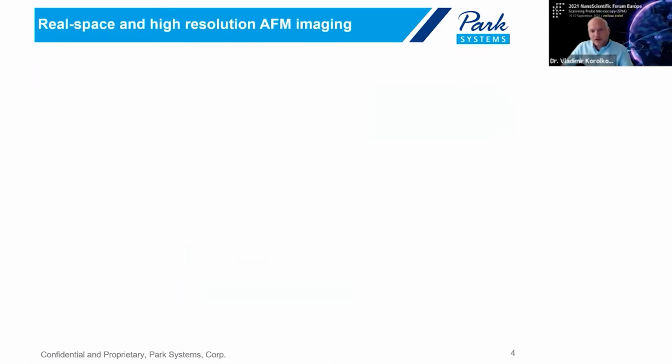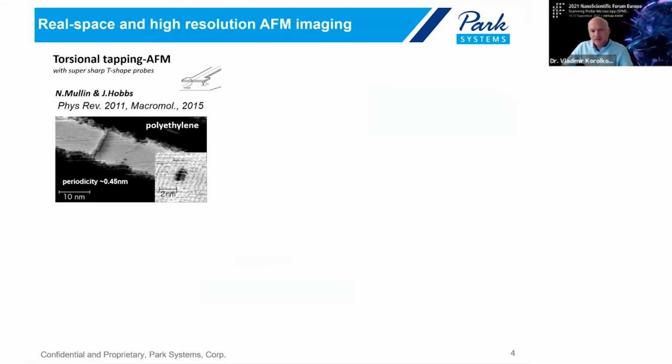So here I made a quick overview of some techniques that provide more or less routine high resolution imaging on ambient AFMs. And perhaps the first one, and actually that was a technique that inspired me some years ago and made me believe that with the ambient AFM you can achieve the resolution that was thought to be the usual STM type or some kind of ultra high vacuum type resolution.